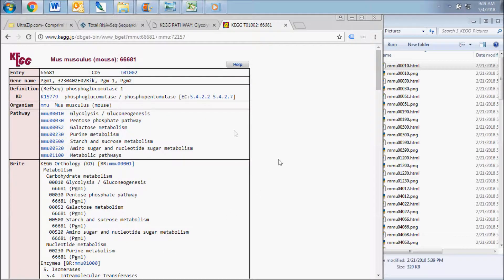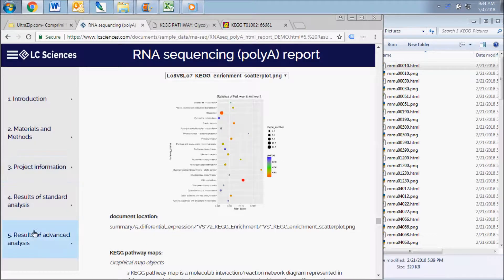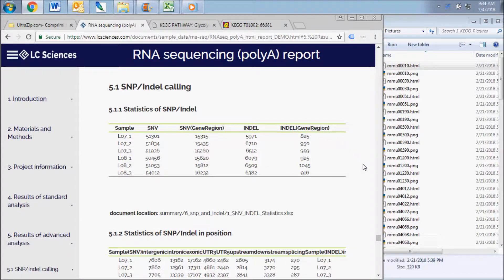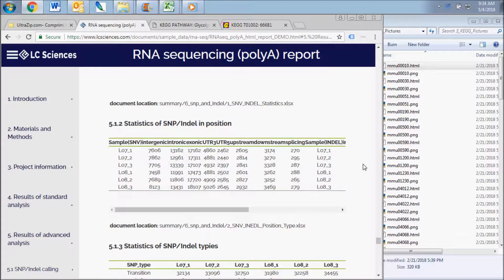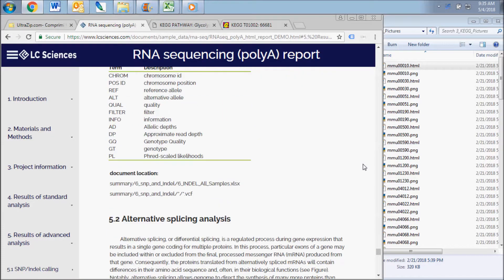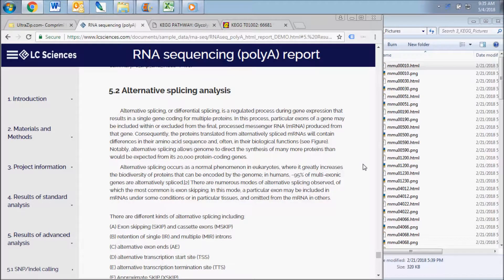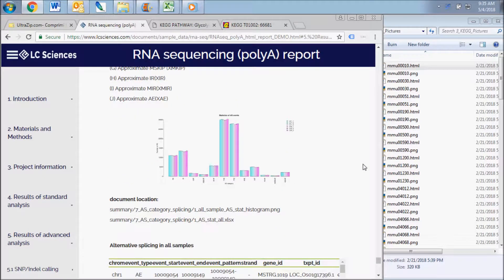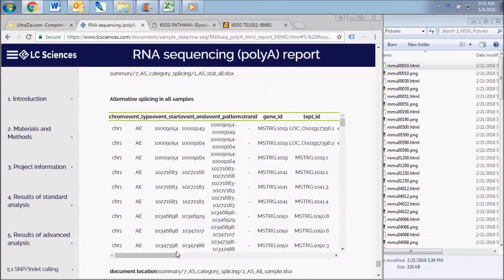If you requested advanced analysis with your order, your report will contain sections for mutation and alternative splicing analysis. The SNPs and INDELs results subsection displays data contained in the SNP and INDEL folder. The first chart displays the statistics for the different types of alternative splicing events and the chart lists and describes each of the alternative splicing events sequenced in your samples.